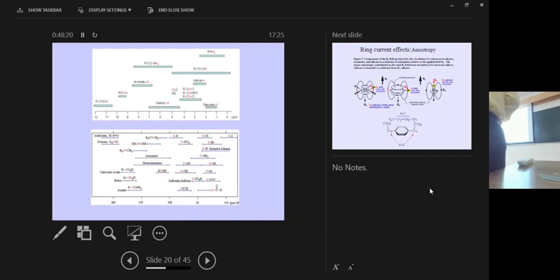Okay. On the basis of this, you have various kinds of chemical shifts there. For various groups, you have saturated things like the CH3 groups and things like that. They appear on this chemical shift scale, 0 to 12 ppm. They appear at this position here, or if the group is like this, they appear here and like this. So depending upon the nature of the group, the signals appear at different positions in that chemical shift scale. So we're always talking about the proton, okay? Everywhere here we are talking about the proton.